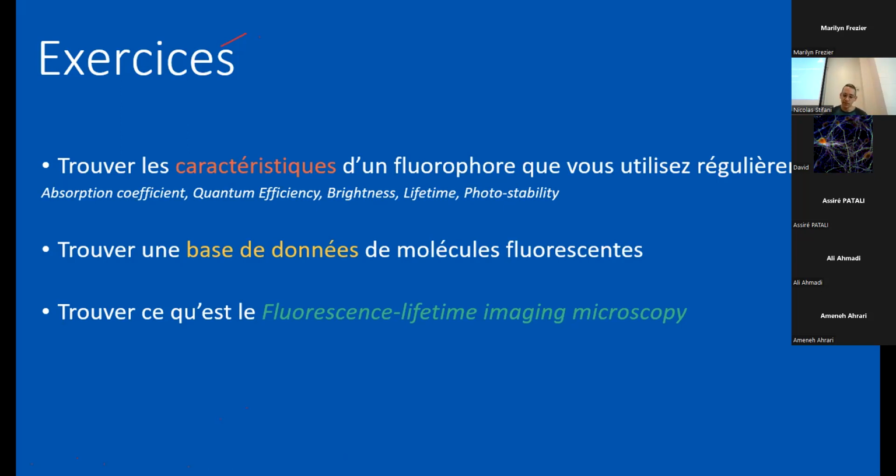Well, actually, you can ask yourself, why am I using this one? Is there a better one? That's why I want you to think about it and actually go and find this information, because it's really important. You can improve your experiment a lot by thinking, okay, 488 is good, but I see that Cy5 or Cy7 is better. Maybe I can just change my secondary and I'm going to improve my signal drastically.